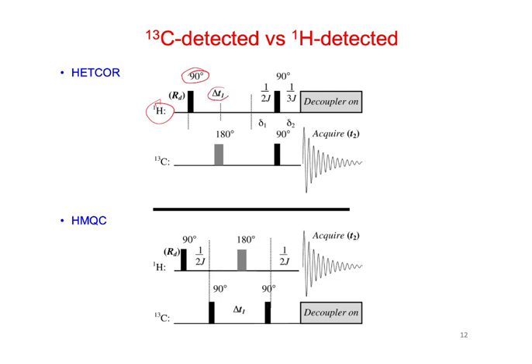Here's our evolution, our increment that we're going to do. This looks like it's kind of like a spin echo or something here. And then finally, our acquisition is on C13. Okay. For the HMQC, we have noticed that, well, I guess the first signal is still on proton, but we're acquiring on the proton as well.